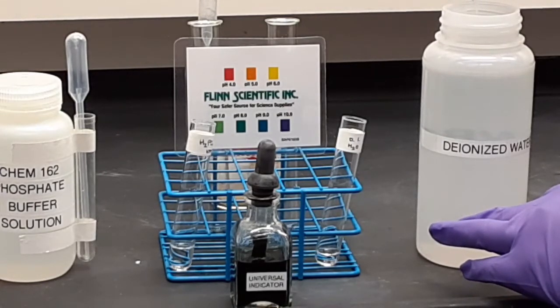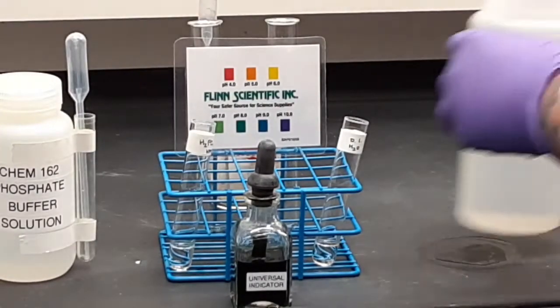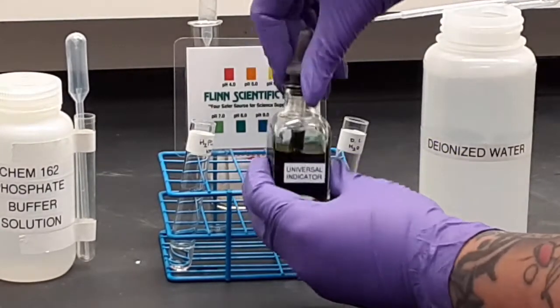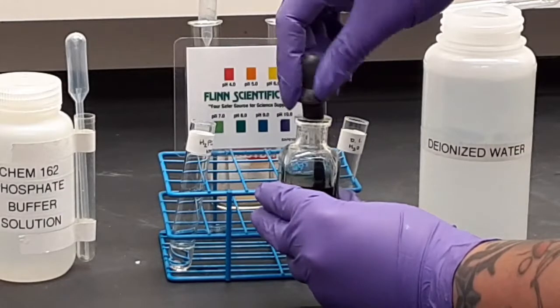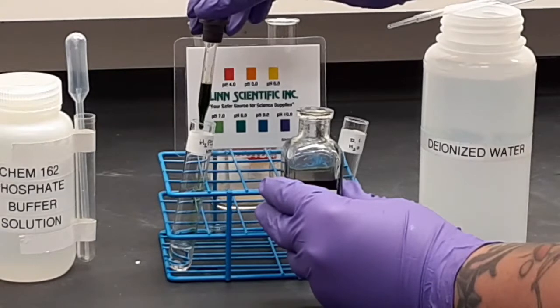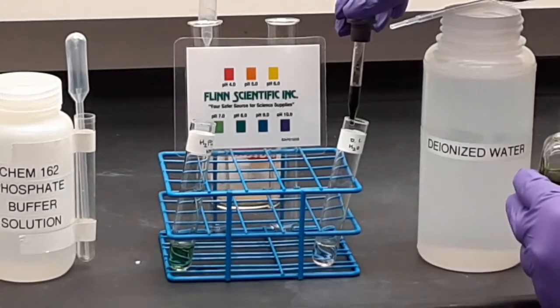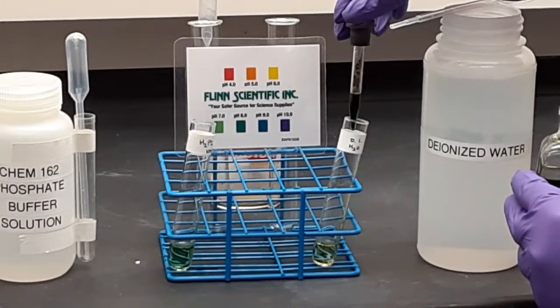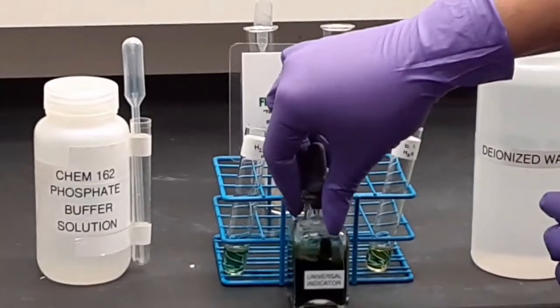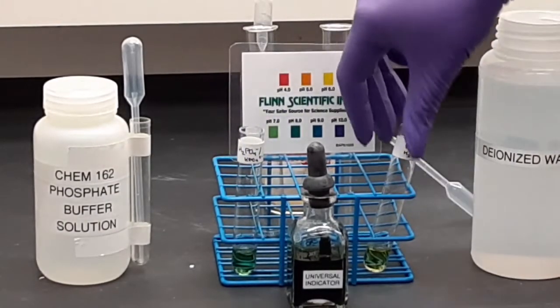Now the calculated pH of our buffer, for what it's worth, is approximately 7.4. This indicator is very sensitive right around pH 7. So the two colors are not exactly the same, but they're close.